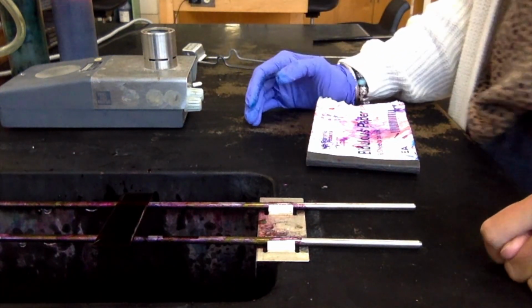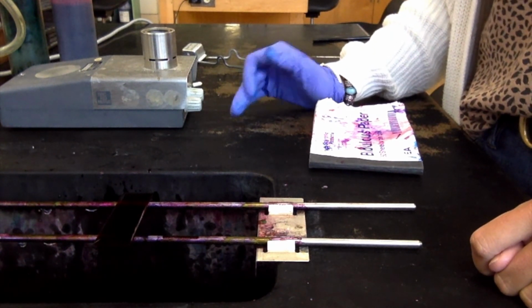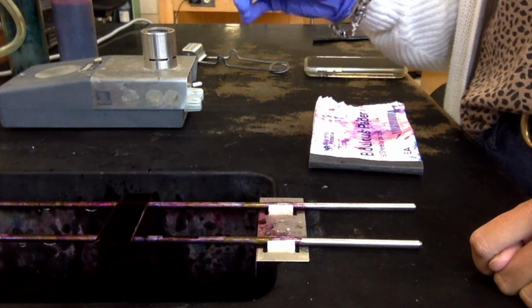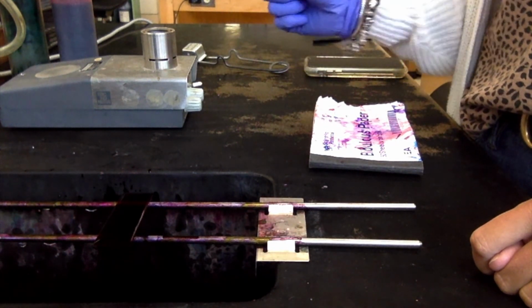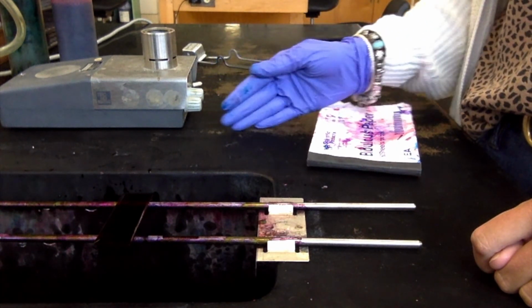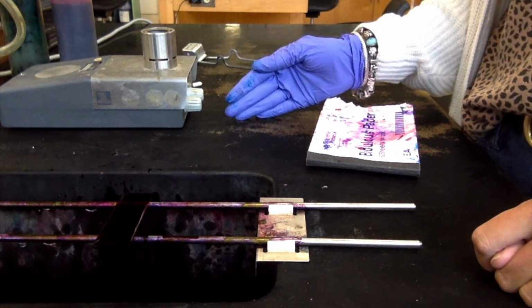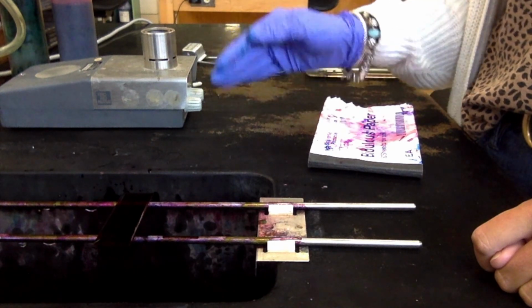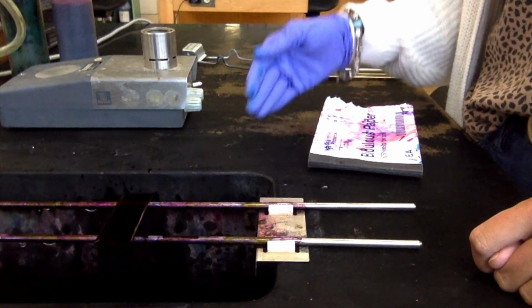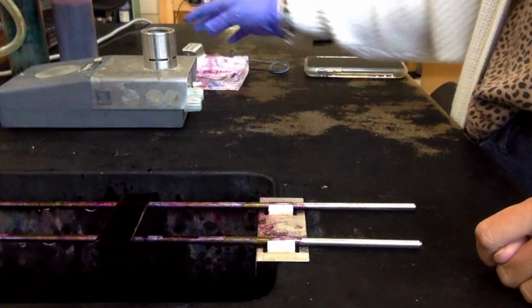Now, one of the things that you want to do when you're looking at these under the microscope is see where the spore is located. So each bacteria forms its spores in a different location in the vegetative cell. So you've got a centrally located spore, and that is going to be, of course, right in the center of the rod. You have a subterminal spore, which is almost to the end, but not quite. And then you have a terminal spore, which is going to be all the way at the end of the rod. So once we look at ours, we will see where our spores are located within that vegetative cell.